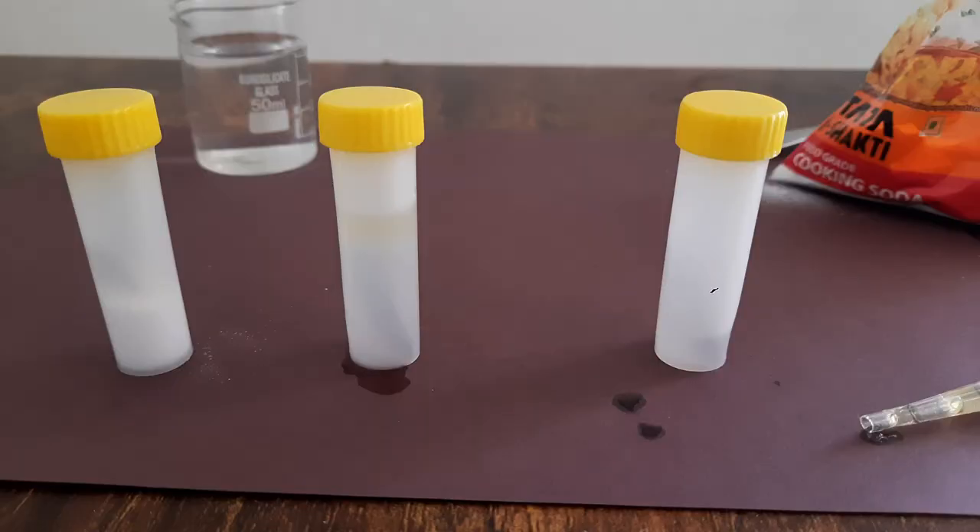Now we have these three plastic tubes with iron nails in them, but what is inside these tubes apart from the iron nails is different. In the first plastic tube on the left, we have baking soda. Baking soda absorbs all the moisture in the air around it — it absorbs the water molecules in the air. It's called a dehumidifying agent. In the tube in the middle we have boiled water and a layer of oil on top of it.